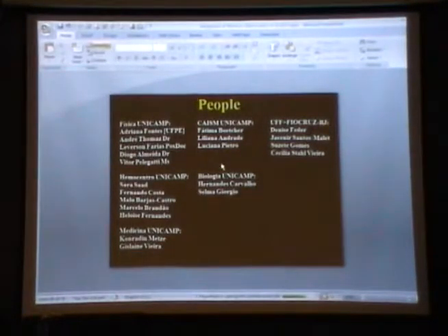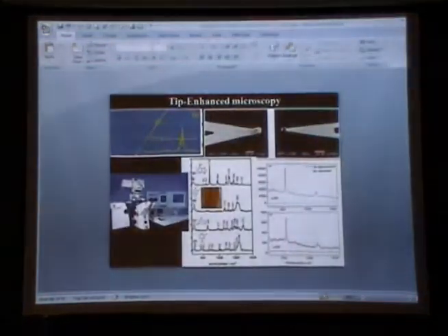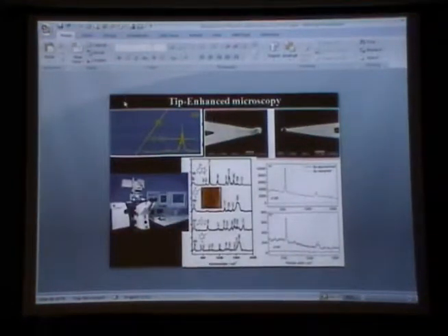Does the tip have to be metallic? Is that a conductive tip? It can be also semiconductor. But if it's metallic, it's much better. It's like the lightning rod effect. So you're going to enhance it quite a lot.